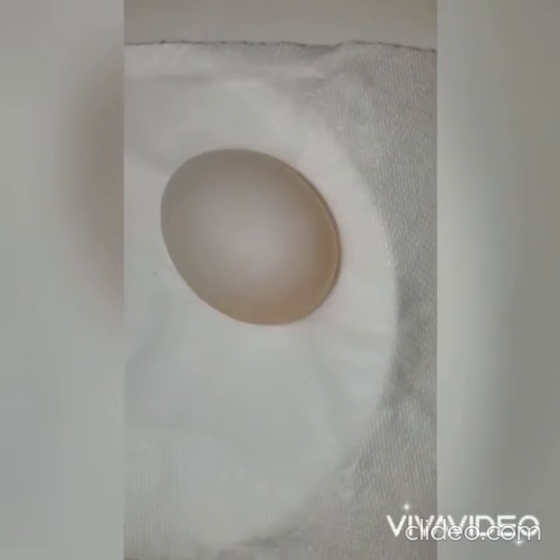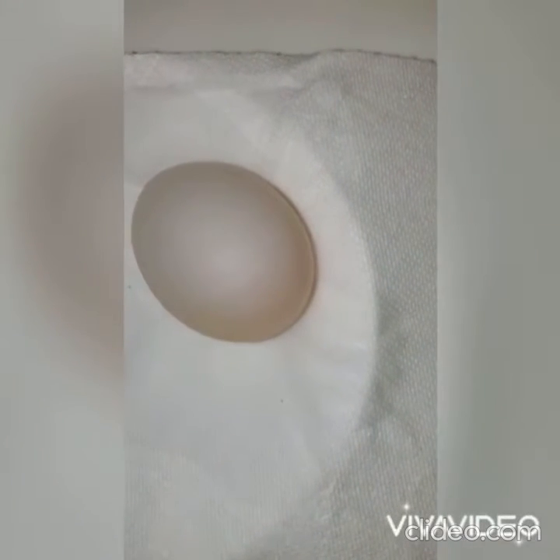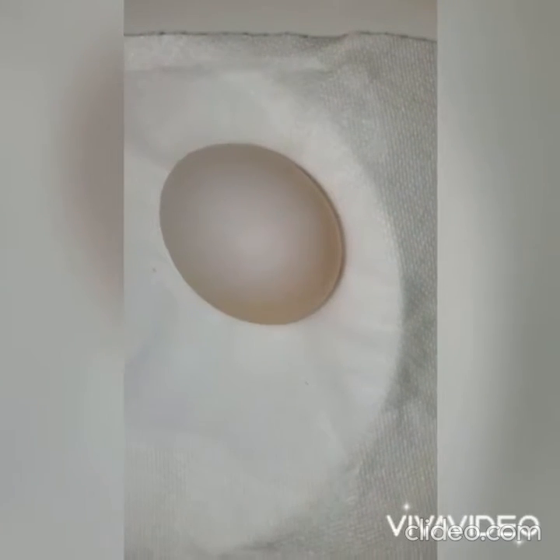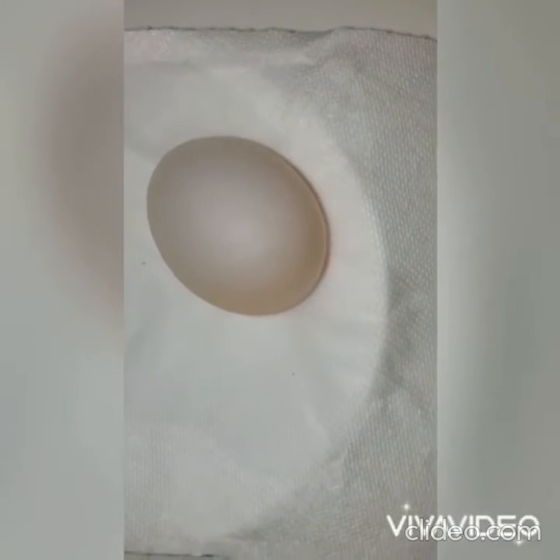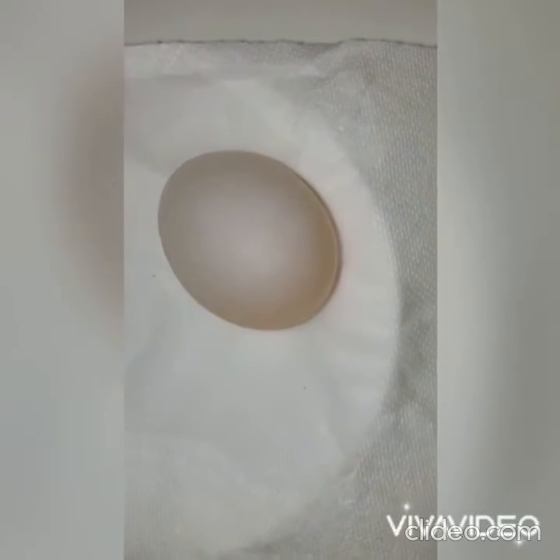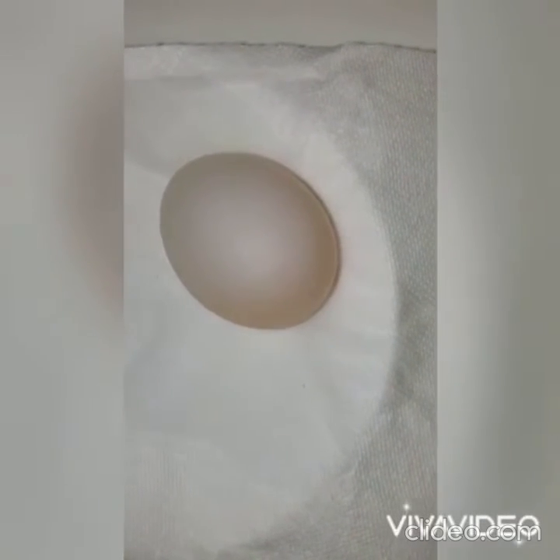So, the egg expanded when placed in vinegar because vinegar is almost 95 to 96% water. Since it has a higher water content than the egg, the concentration gradient between the egg and its surroundings increased. Thus, water moved into the egg to reach equilibrium.